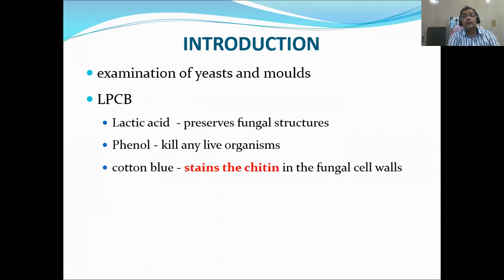And this is also an advantage. We had seen the advantage of fixing the slide in bacteriological staining. So here the phenol acts as a fixative agent, and that will kill the pathogenic fungi, and they will remain not infectious to the handler.